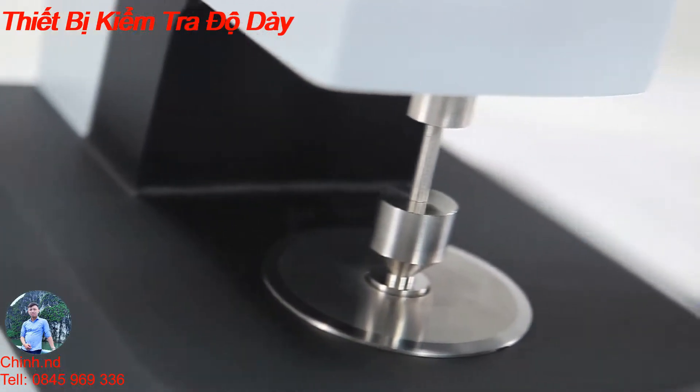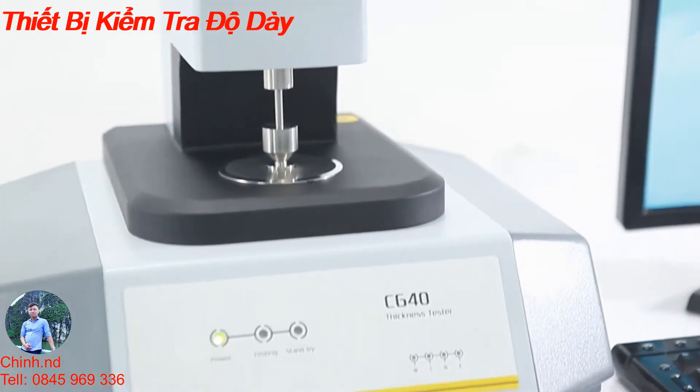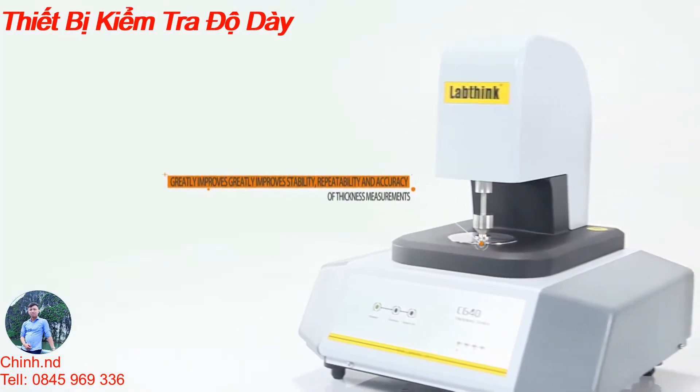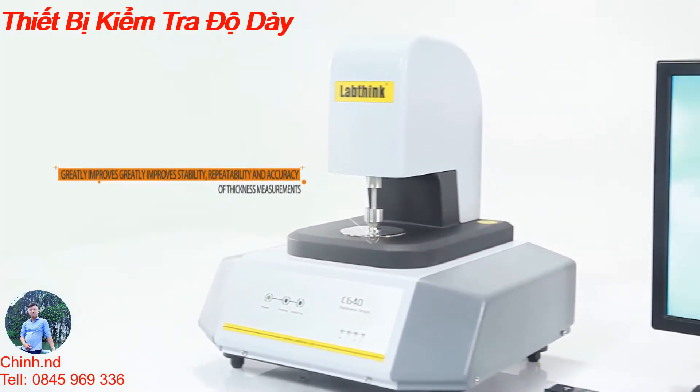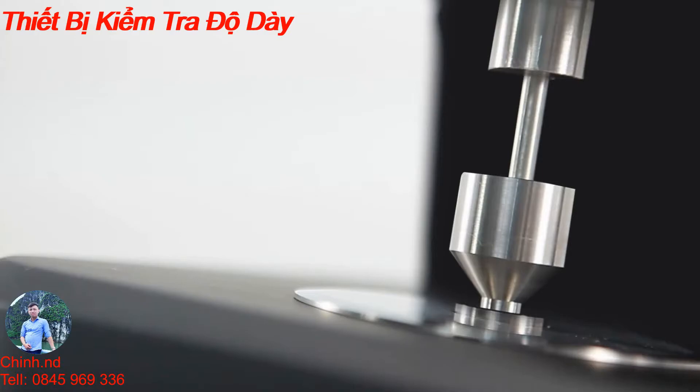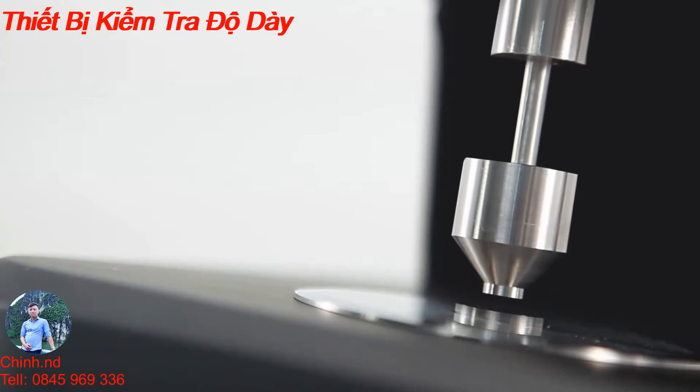The C640 thickness tester uses a high-precision displacement sensor supported by scientific structure and professional control technology, which greatly improves the stability, repeatability, and accuracy of thickness measurements. The pressure foot can be lifted and lowered automatically, which minimizes errors caused by human operation.